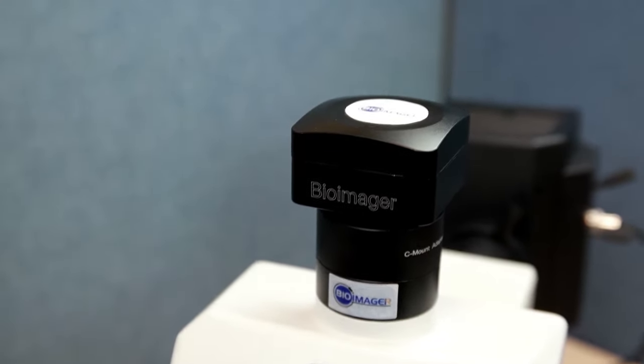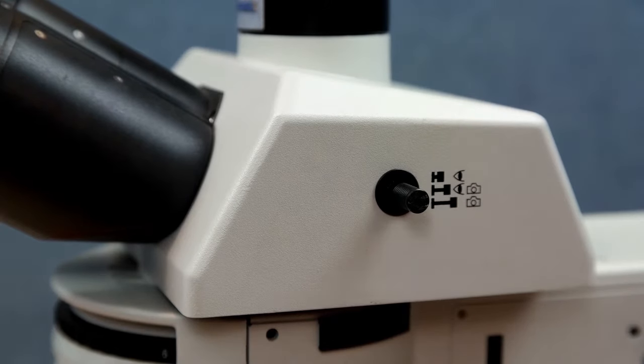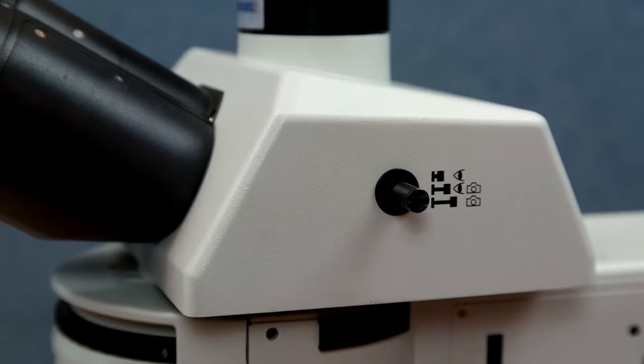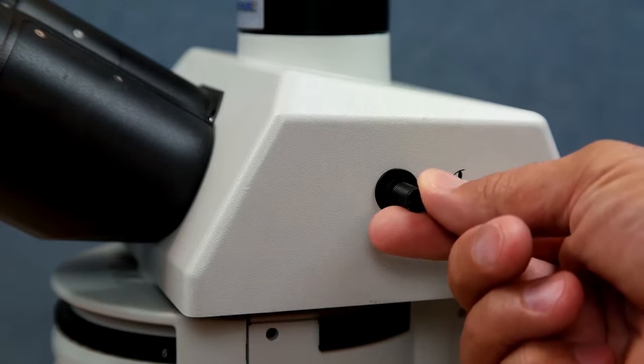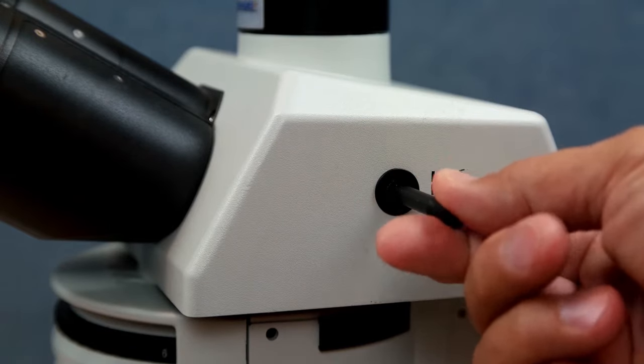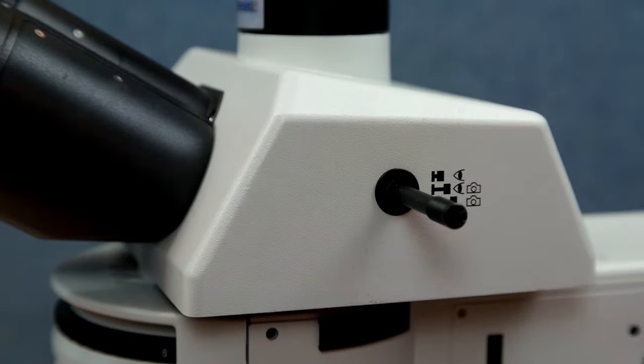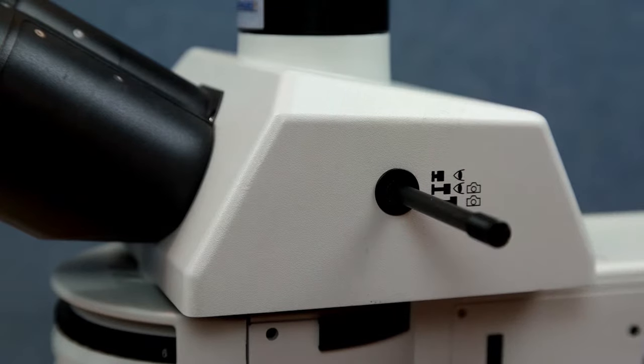The image signal can be split between eyepieces and camera using this lever here. It can be 100% to eyepieces, 50-50, or 80-20 between eyepieces and camera, and also 100% signal all goes to camera.